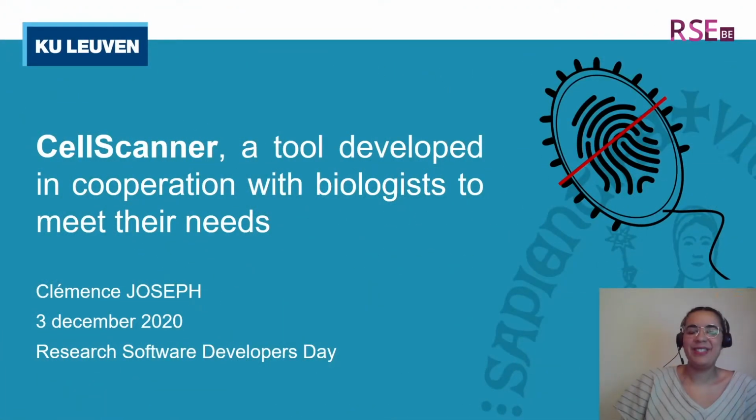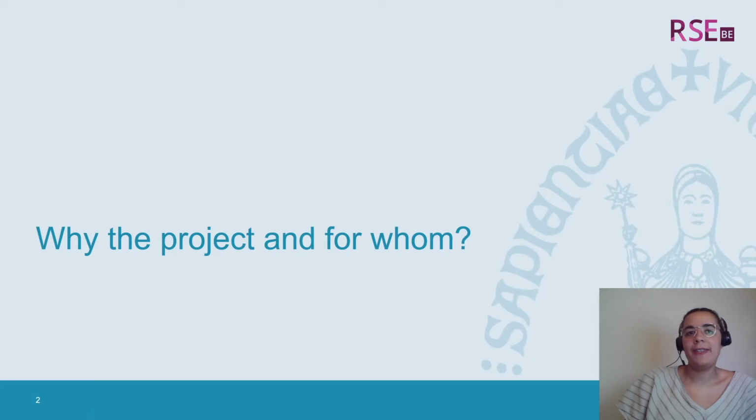Hello everyone. So today I will tell you how we adapt a bioinformatic method to make it accessible for biologists by cooperating to develop the tool CellScanner. The first question is, why this project and for whom?